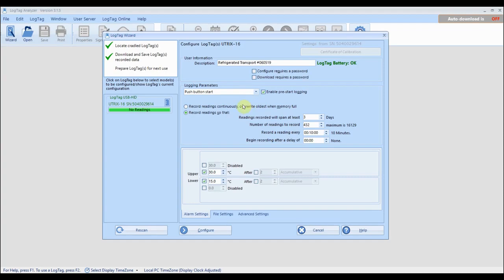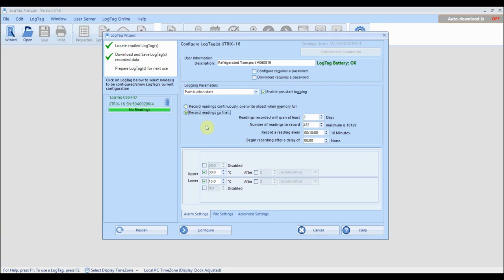Next select whether you want the logger to stop recording once the memory is full or to overwrite the oldest readings so logging never stops. This is called continuous recording. If continuous recording is not selected, you can specify the number of days you wish to record for. The number of readings to record is changed according to the duration and frequency of your readings.